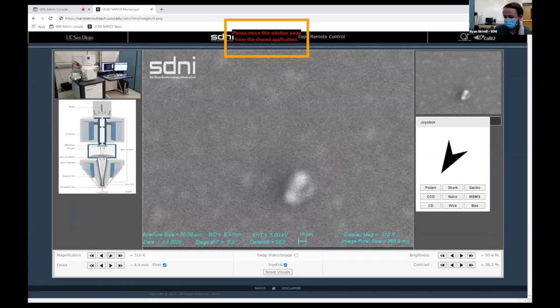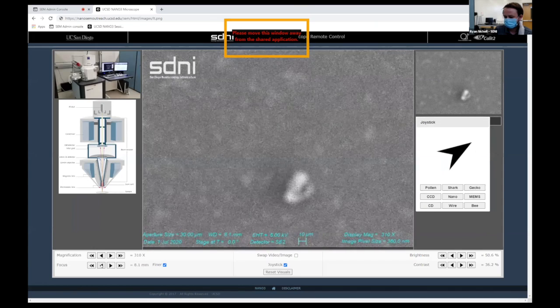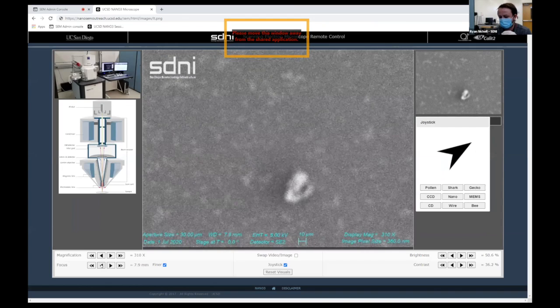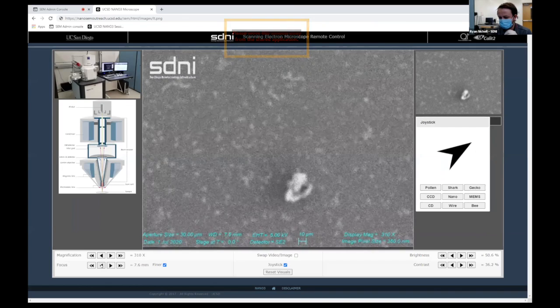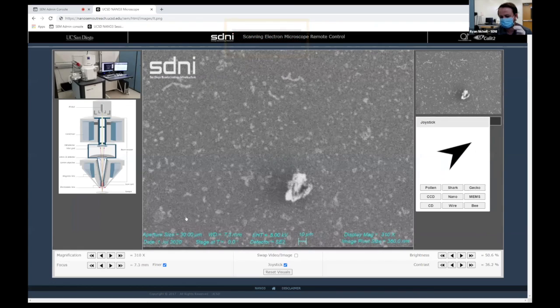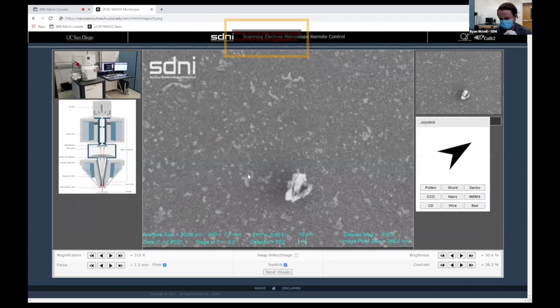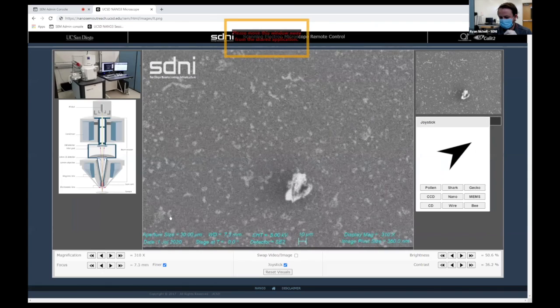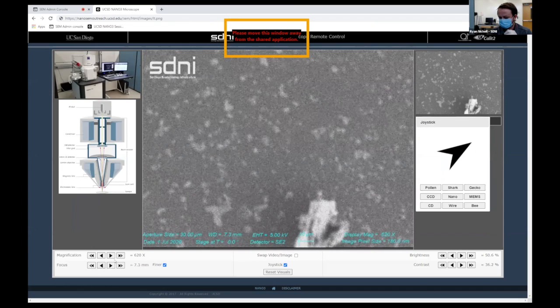But we're not focused up yet. I'm trying not to do anything right now. I want you to have the full experience. So keep going. I think you're going in the right direction. So you're starting to see maybe some pepperings of features. That's not a nanoparticle. That's a bit of junk. See the smaller stuff? Yeah, that stuff. Go, try to focus on those guys.